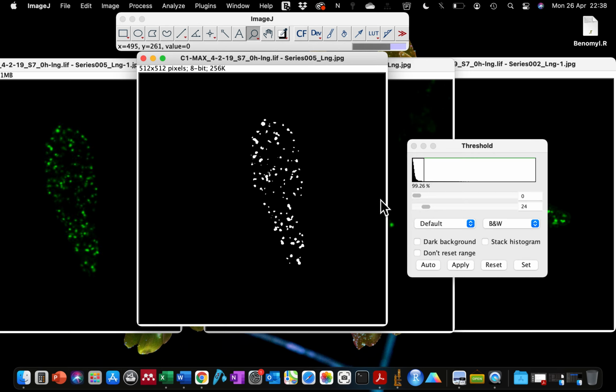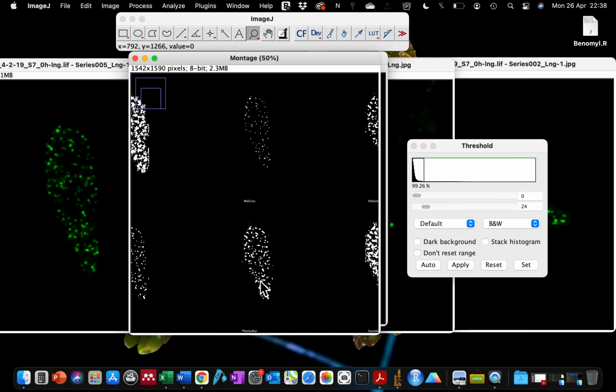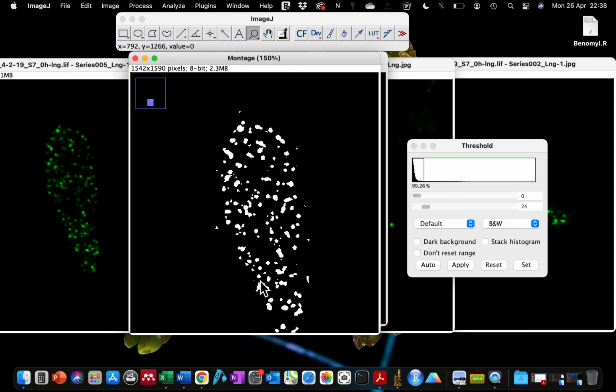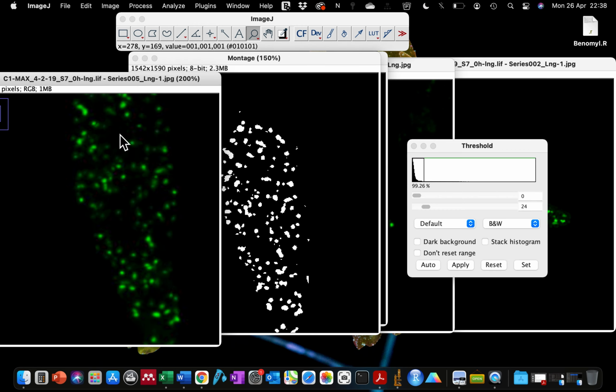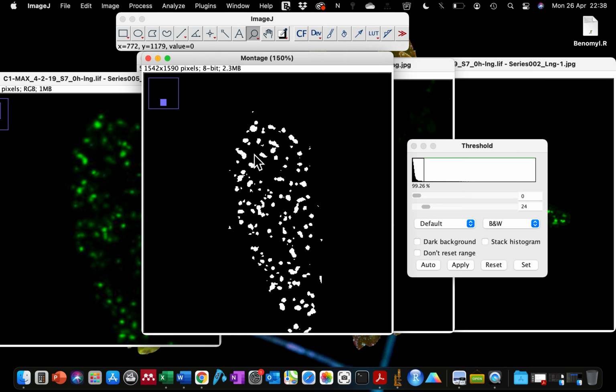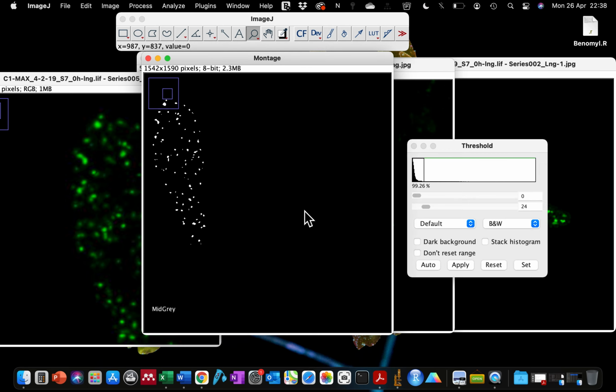You can see that it added extra noise to the 9 different types. Some added extra noise. This is the one I've used in my previous study, because you can see it's almost exactly like what we have in our actual image. That's why I prefer this particular one over the rest of the ones that had extra noise.